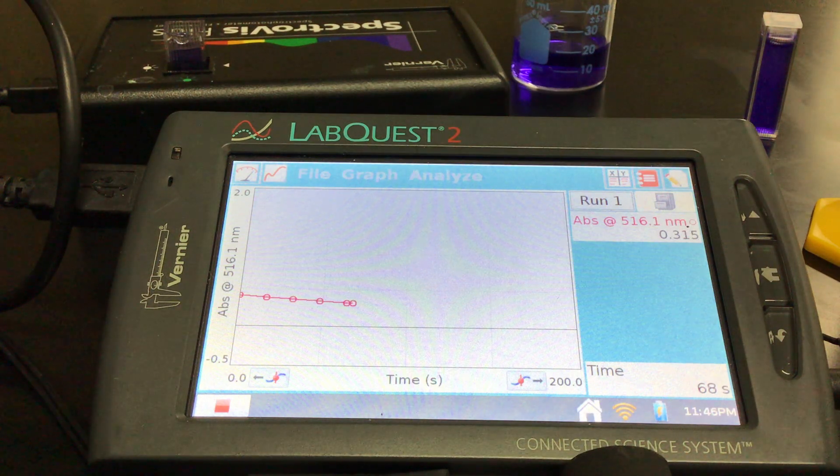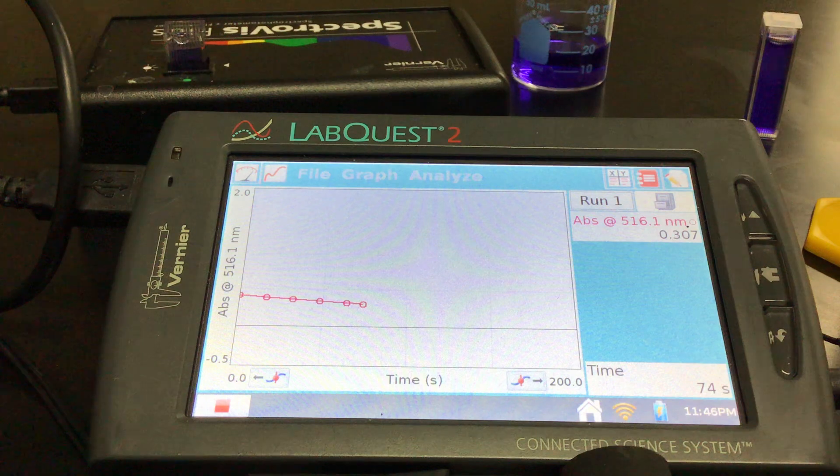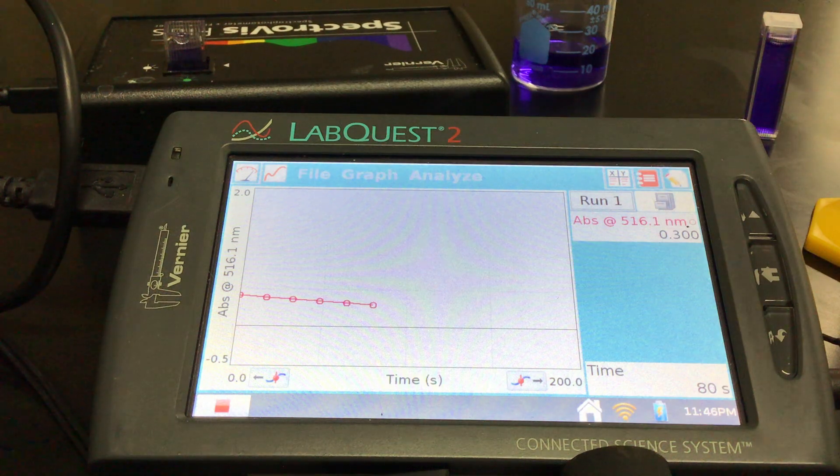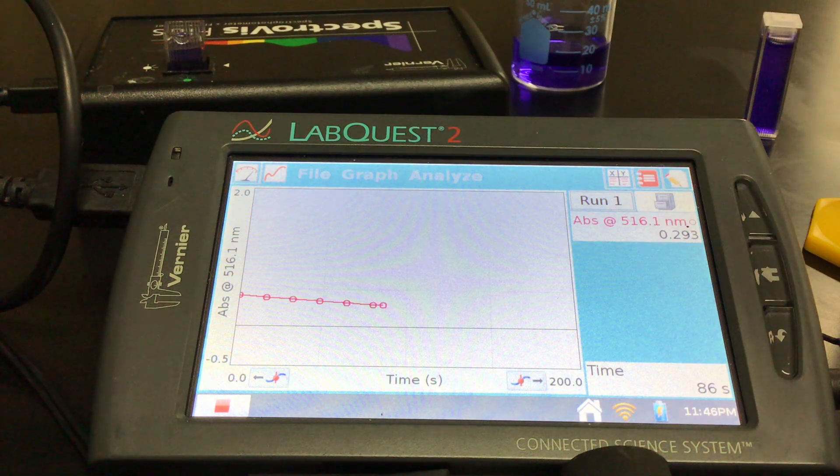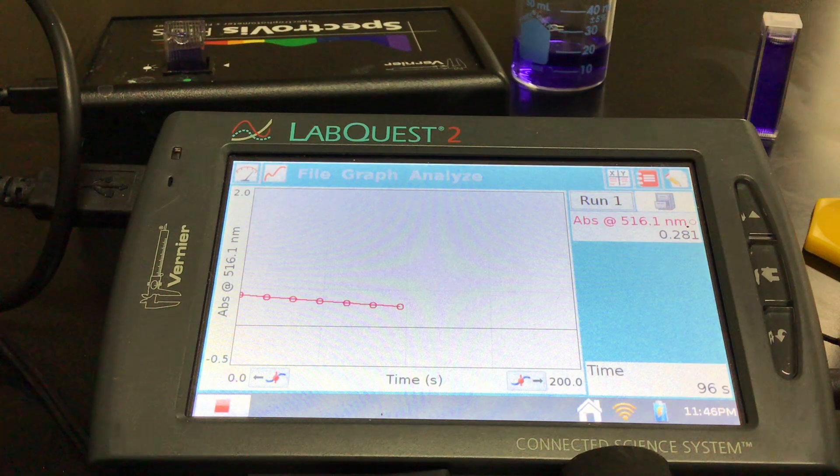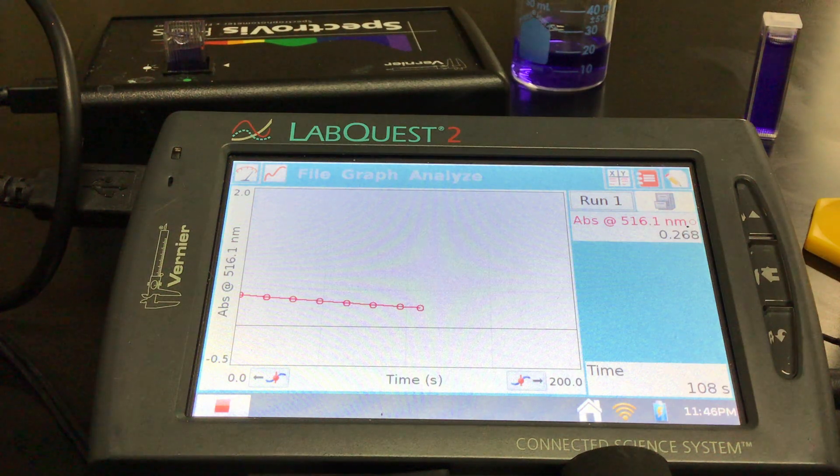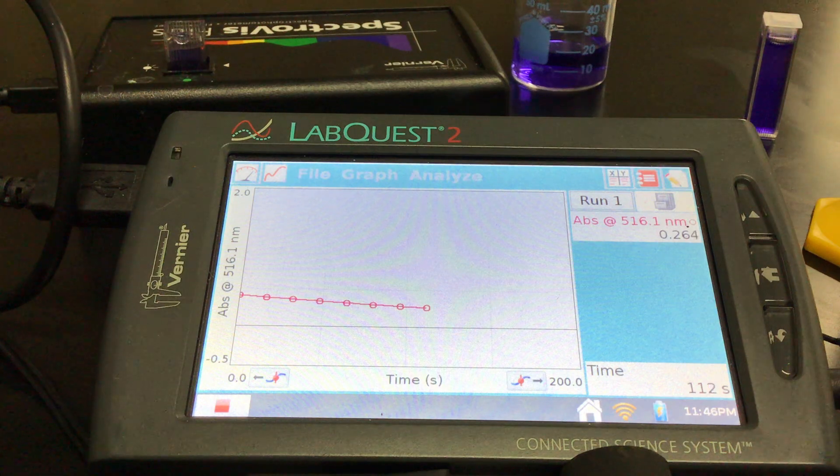If we have to integrate it and do the natural log of absorbance, then we're going to know that it's first order. If we get one over the absorbance, it's going to be second order. We'll show you how to do the calculated columns in our table, and that's going to be a powerful tool. It'd be a pain to have to put this into your graphing calculator or Google Sheets or Microsoft Excel. The LabQuest will do it for you, so it's a pretty awesome piece of equipment that we've got.